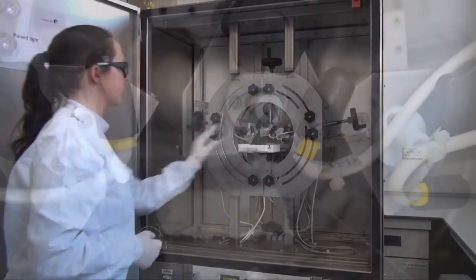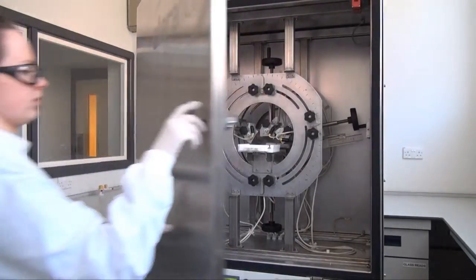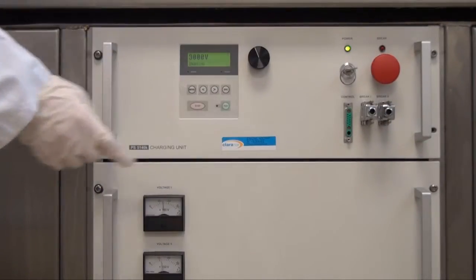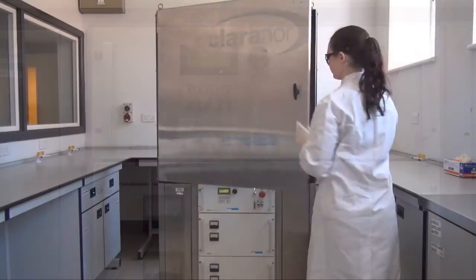The distance and angle of these affects the intensity of the light. With the sample in the chamber, the capacitors are charged and then discharged to generate broad-spectrum white light.